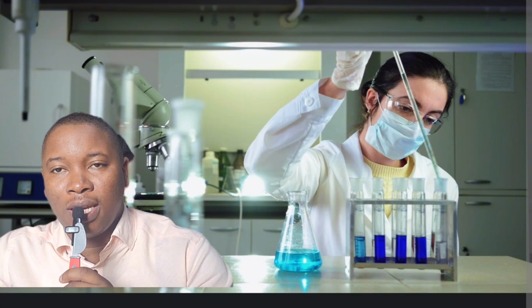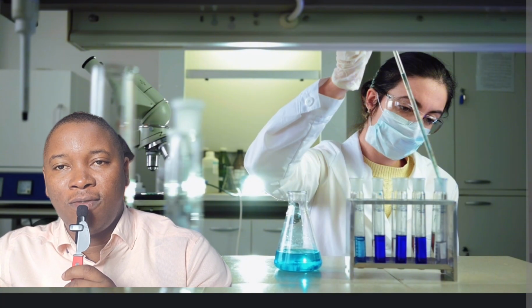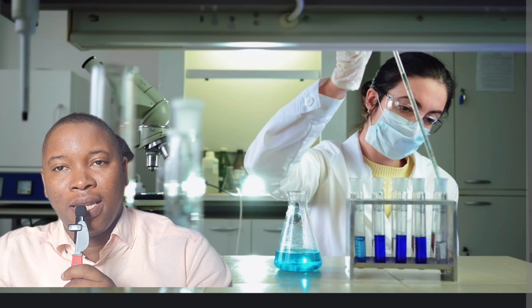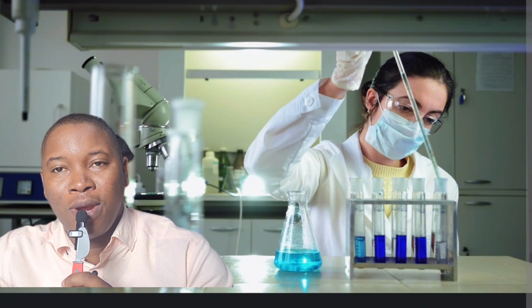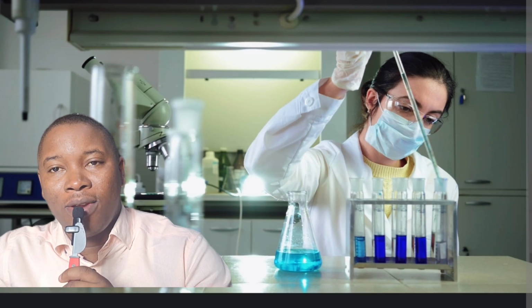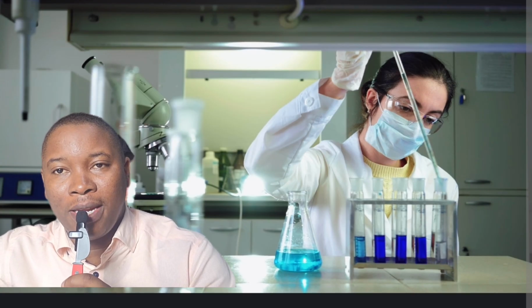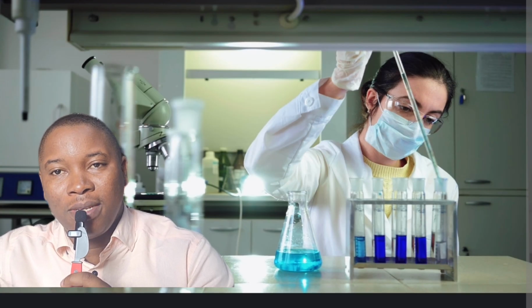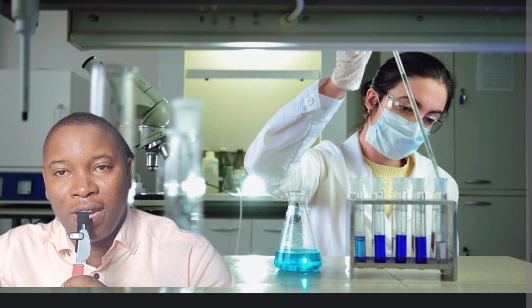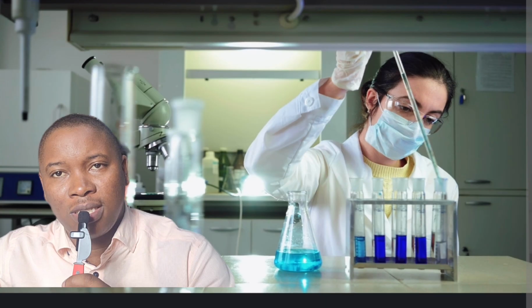In this particular test, the Indole test, we're testing for the presence of tryptophanase. Tryptophanase is an enzyme that is present in some bacteria, and it has the ability to break down an amino acid called tryptophan. So the amino acid which this enzyme can break down is tryptophan, and the test is to check for the presence of tryptophanase in bacteria. That's a simple test and explains simply what we're doing.